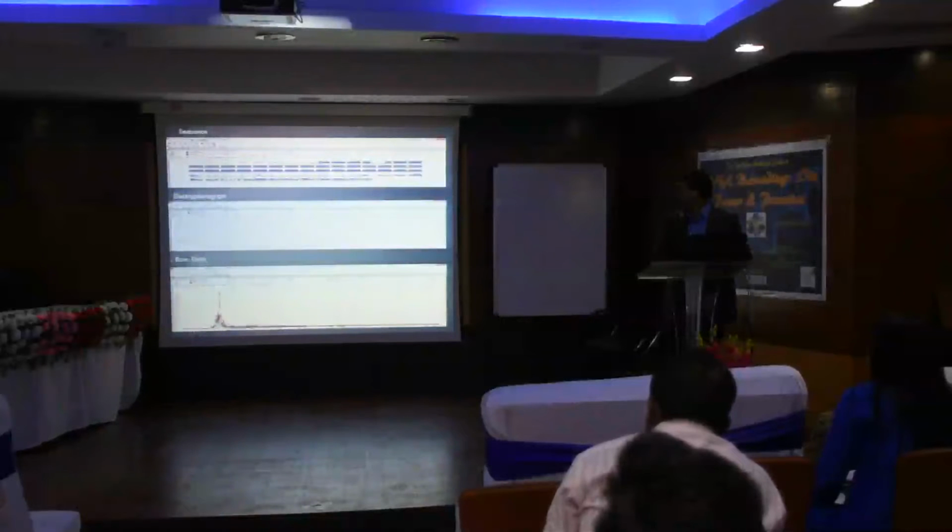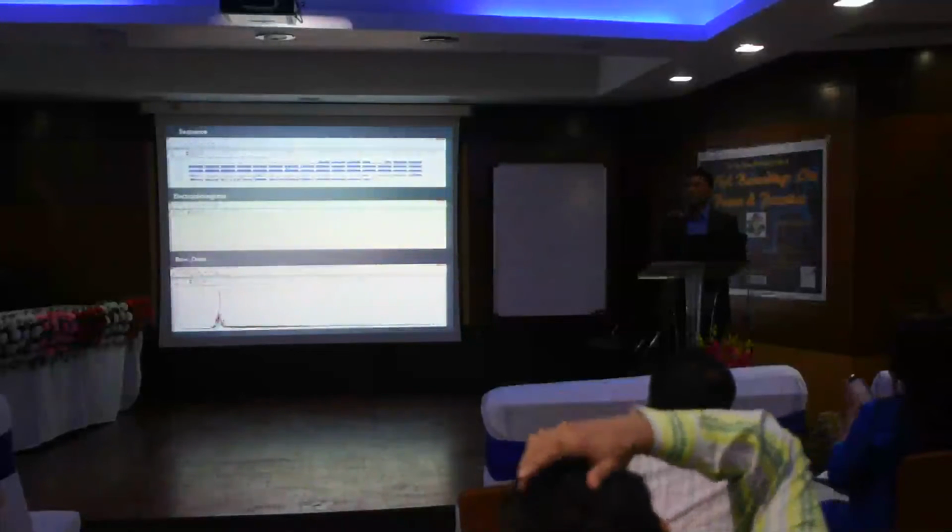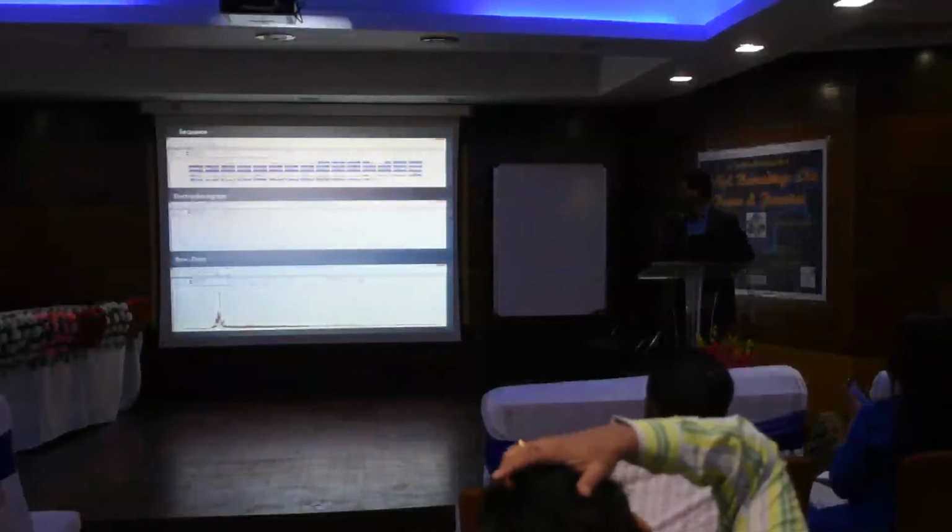If you are getting such a thing, it is good. But here also you see it is very poor in between. These red dots are the worst thing. This sequence is of no use.